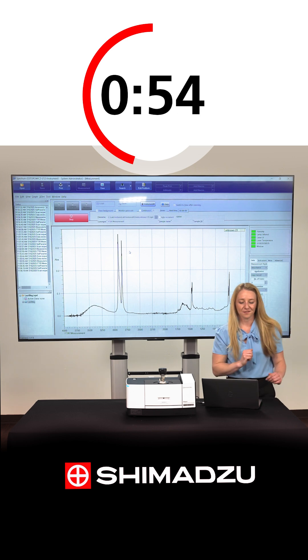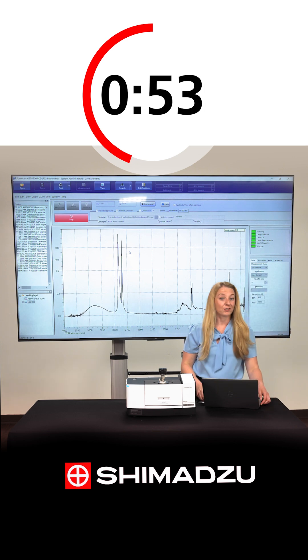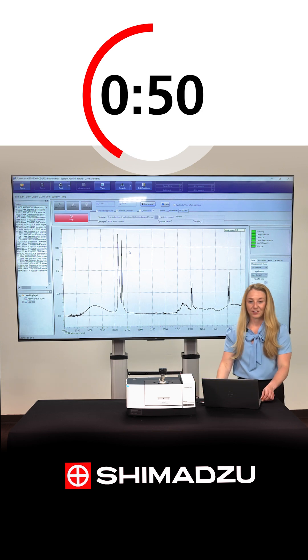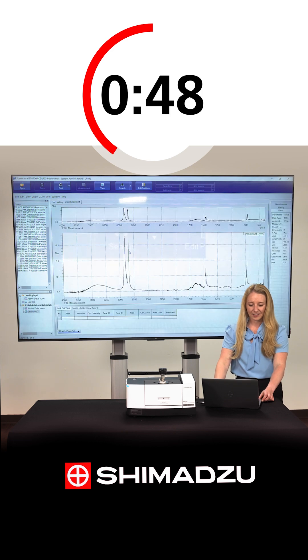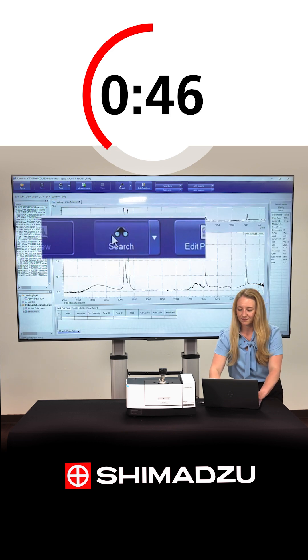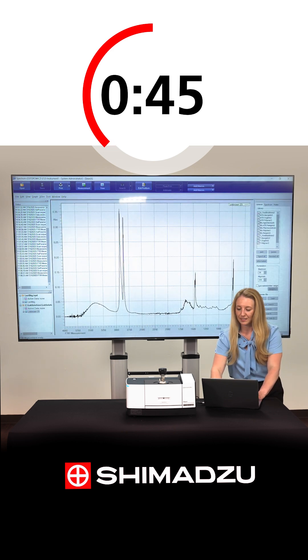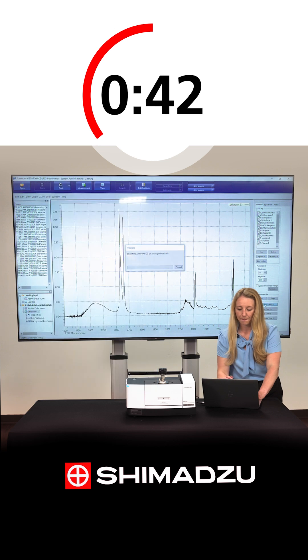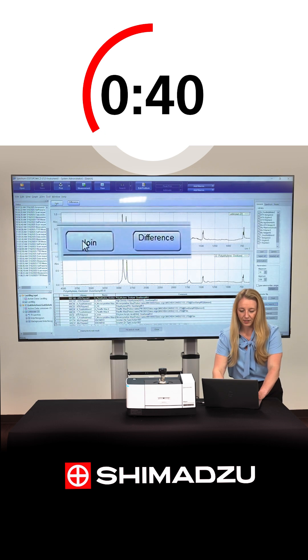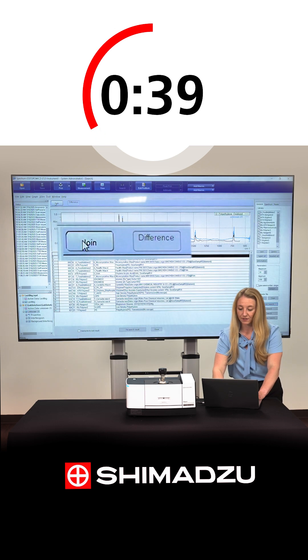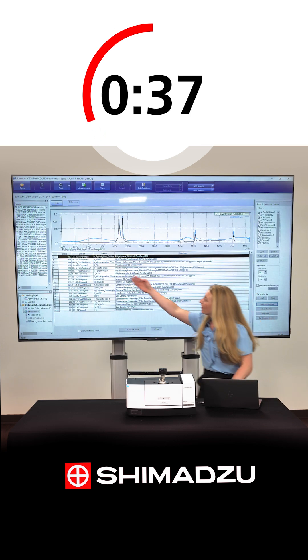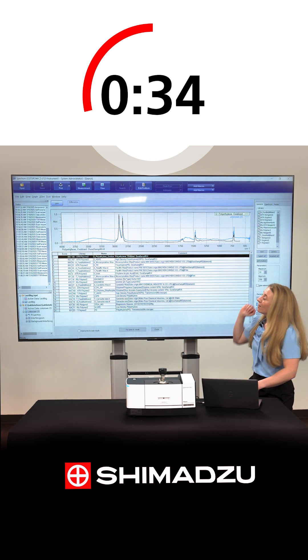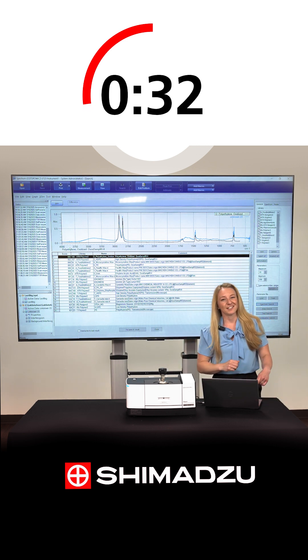Here's our spectrum of our unknown. In order to identify it, we're going to library search it. As soon as the scan is complete, I'm going to select search, select the libraries I wish to search, and run the search on our unknown. And we can see, with a score of 905 out of 1000, our unknown is most likely oxidized polyethylene.